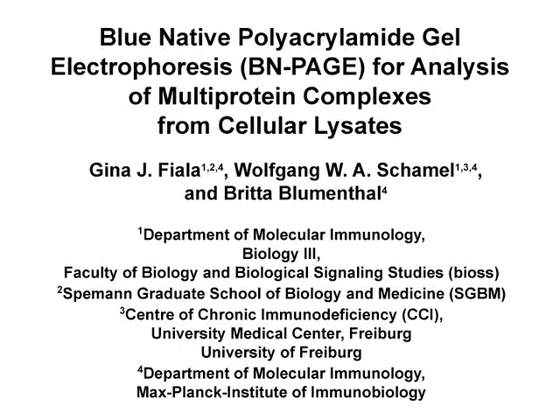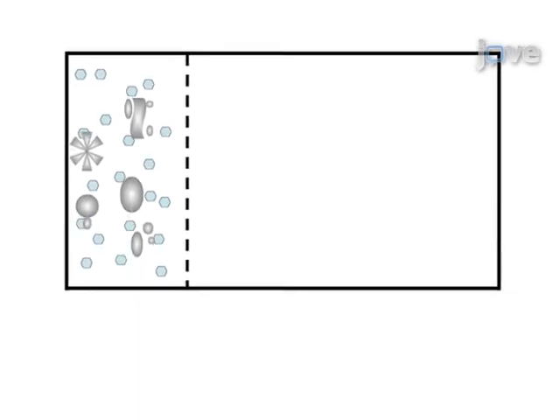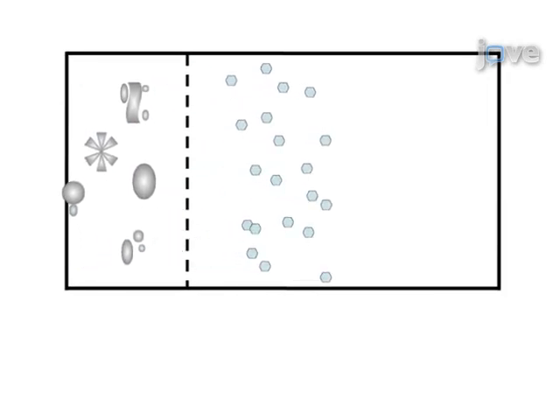The overall goal of the following experiment is to characterize a multiprotein complex from cellular lysates using blue Native-Polyacrylamide gel electrophoresis, which, in contrast to SDS-PAGE, allows protein separation under native conditions and preserves protein-protein interactions. This is achieved by dialyzing the cellular lysate to remove excess salts, making the sample applicable to separation by blue Native-PAGE.